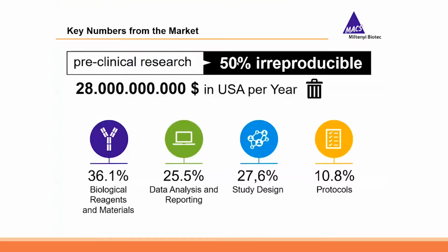This was a figure that was presented in the first webinar, but it talks about the irreproducibility of data globally. And this is related to a research article that was published in PLOS Biology. I would like to think that in the context of manufacturing and these spaces, we don't have some of the same reproducibility challenges that are expressed so highly here with this 28 billion figure that's described.